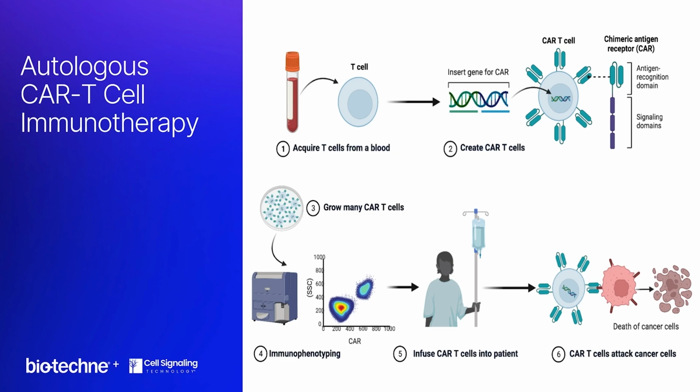The manufacturing of these cells is a laborious process that starts with the collection of blood cells from patients. The T cell population is enriched and activated prior to genetic modification with CARs of interest. These CAR T cells will then undergo ex vivo expansion. This is followed by immunophenotyping analyses to ensure successful endowment of T cells with CAR-dependent effector functions.